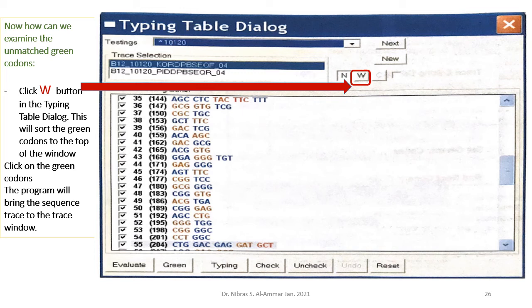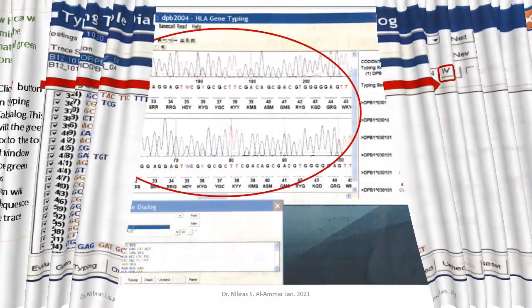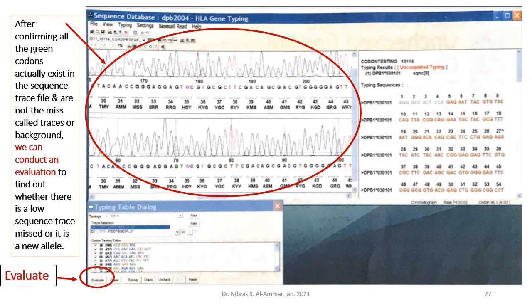Now, as you can see here, we have the sequence and we have to examine each one and follow each sequence and compare it with the database.